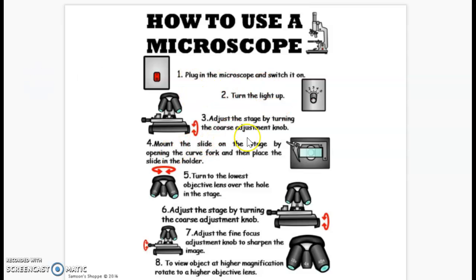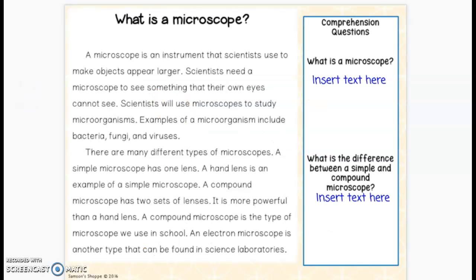And then this is just a quick 8 steps on how to use a microscope. So that is your hyperdoc. You have 2 days to complete this. So please take your time and read the passages and answer the questions correctly. Have fun learning about microscopes because hopefully at some point in time we'll be in class and you get to use them.